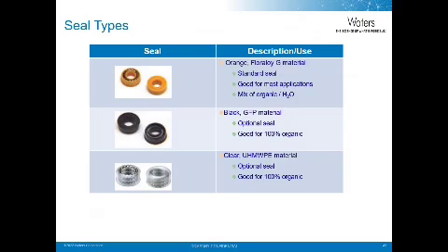There are several types of seals used on the Alliance system. Some customers use different seals than others due to the chemicals and solvents used. When performing a PM, always make sure to use the same types of seals that were in the system prior to the PM. Also, use the installation tools to seat the washers and seals properly.